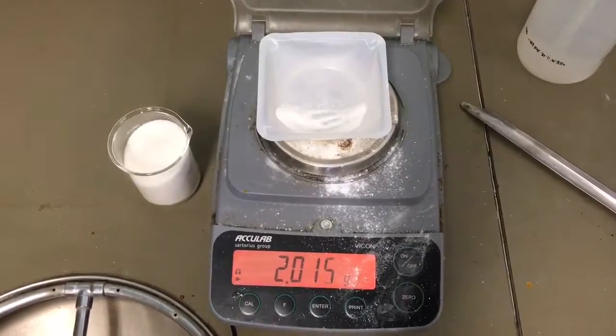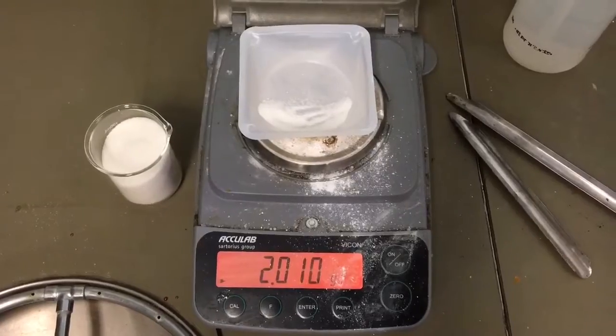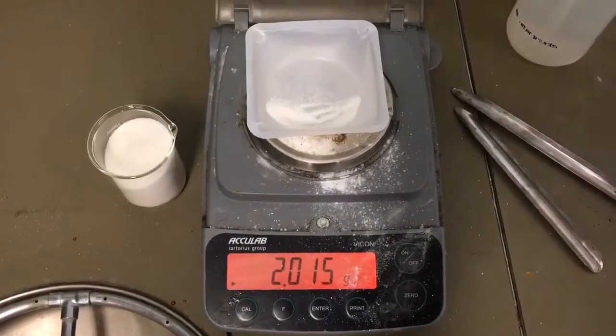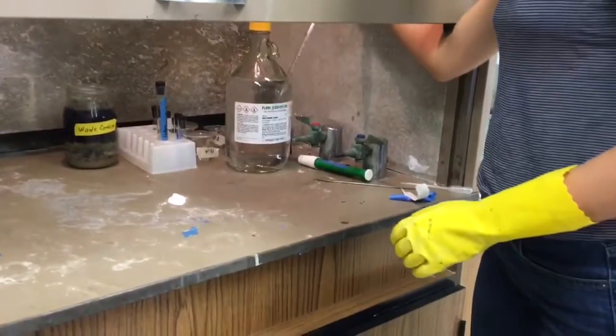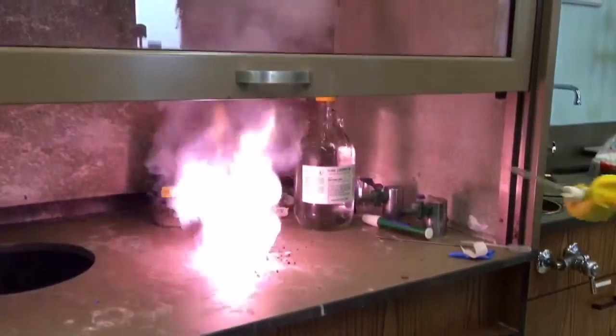Measure 2 grams of sucrose on an electronic balance to 3 decimal places. Mix the sucrose and solid potassium chlorate and place on the bottom of the fume hood. Add a small drop of 18 molar sulfuric acid to the mixture.